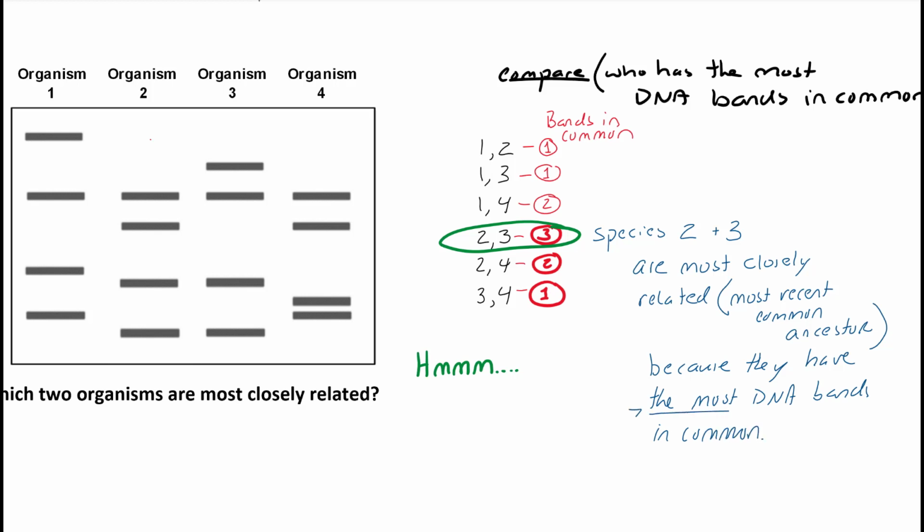Just being a little thorough here with that answer. And it's fine to use the most here because you're just finding which one's most closely related, not a definitive who's the dad or who's the criminal.